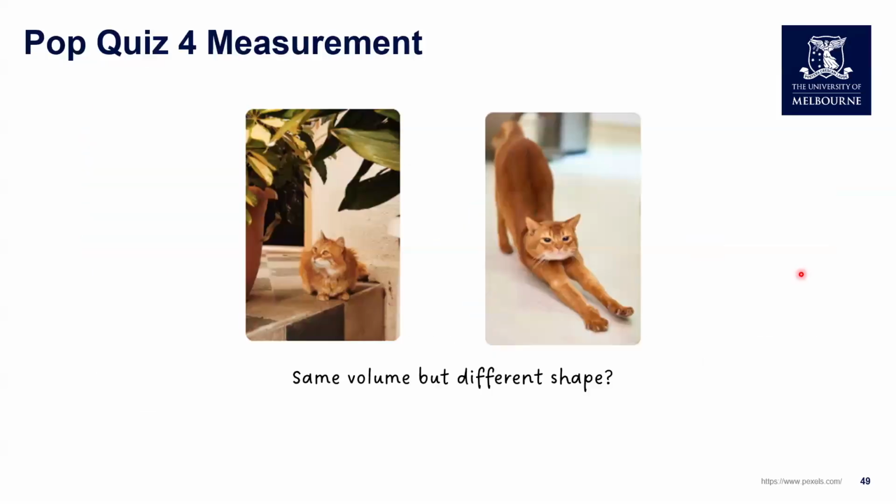Okay, so that's the end of the measurement part. Let's again check our understanding of the measurements. The first question was, what is the best quantifier for comparing the brightness of a microscopic image? Yeah, most people have got the right answer as mean intensity. And that was an easy one. And the second one is to select the correct description of colocalization analysis.